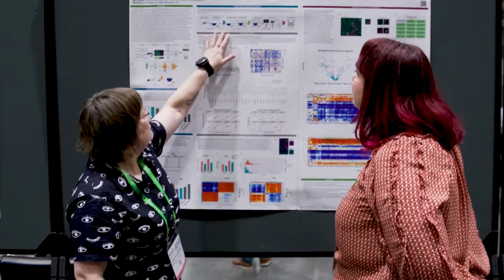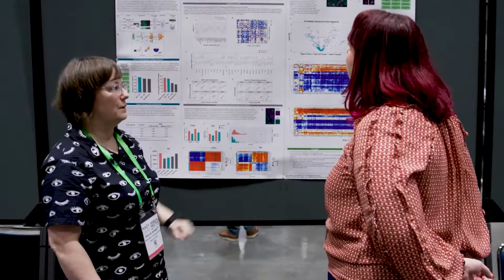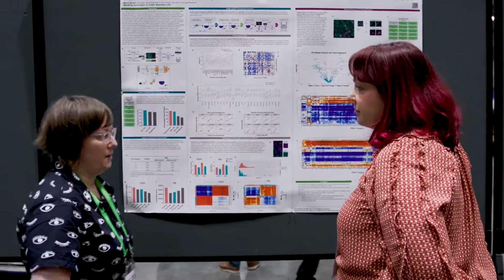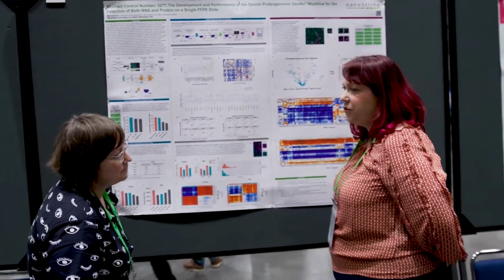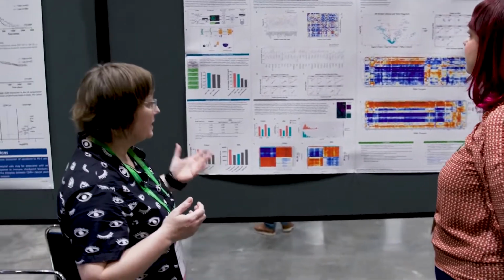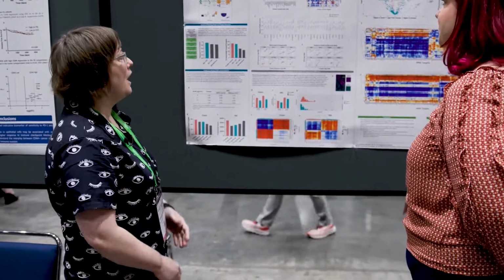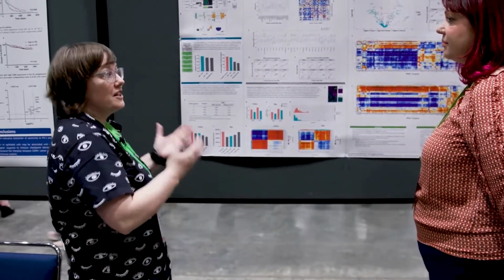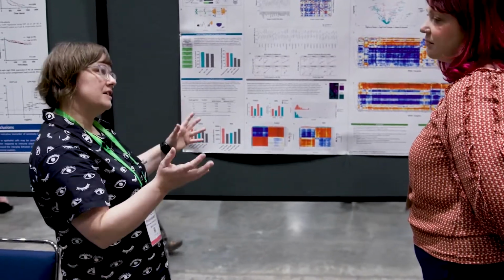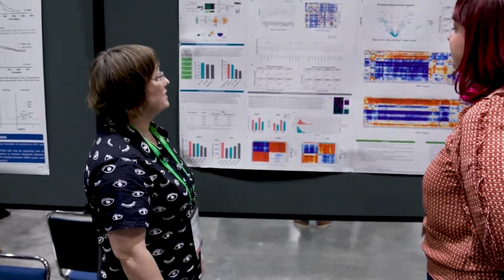So then day two, your normal-ish workup. Then we start to transition into protein. And from there it's pretty much your normal workflow. And then this is read out on an Illumina next-gen sequencer, right? Yes. Because, at least with respect to the human, we have a 147-plex protein content, and using NGS allows us to have higher plexing capability. It also allows us to distinguish RNA and protein based off their barcode, which was critical.